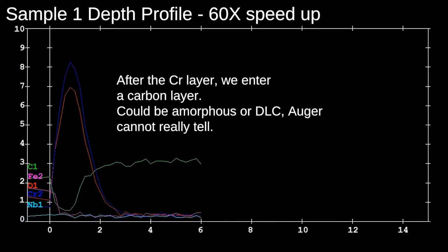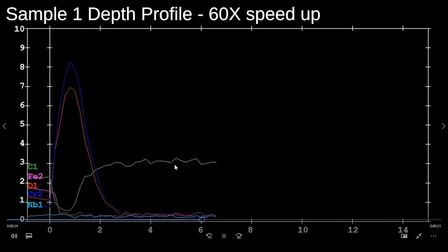So we keep sputtering, and I'm going to pause it right here. This data is unprocessed and raw while we watch the profile, and there is a good reason for that. The data is not normalized in order to allow us to determine if we're missing an element. For instance, if we didn't think carbon was in the stack, we might have left it out of the profile.